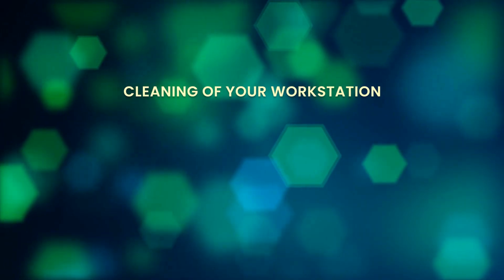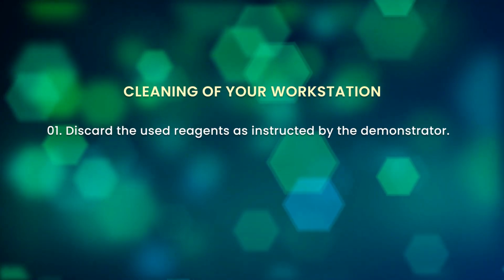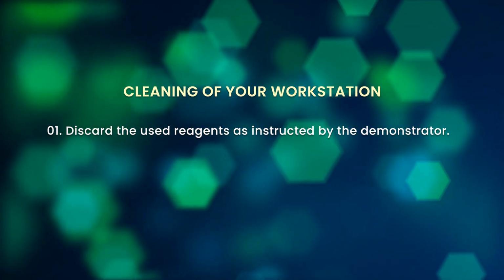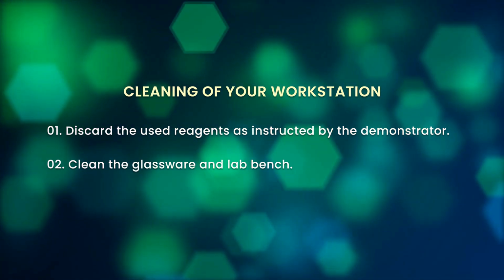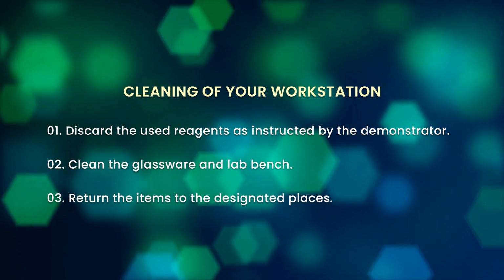The final step is the cleaning of your workstation. Discard the used reagents as instructed by the demonstrator. Clean the glassware and lab bench. Return the items to the designated places.